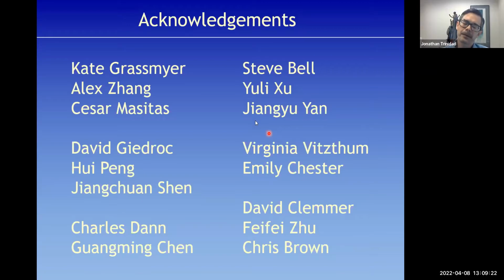So we could talk about this more if you want to send me an email, but there are other groups who have developed tagged crosslinks that allow you to enrich the cross-linked product itself. And so you're in a more intermediate state. I mean, vesicles. We've done actually a fair bit of proteomics on exosomes, right?